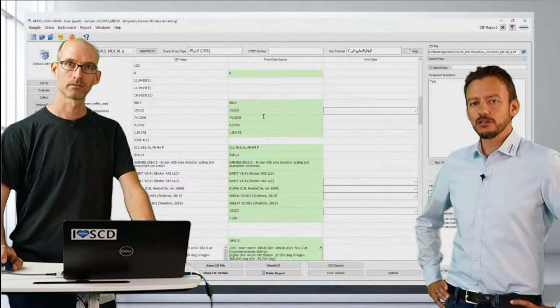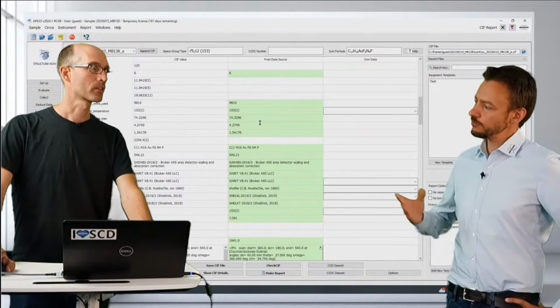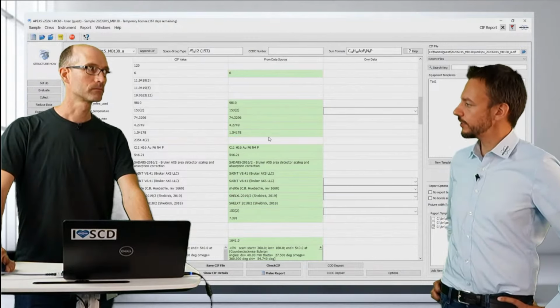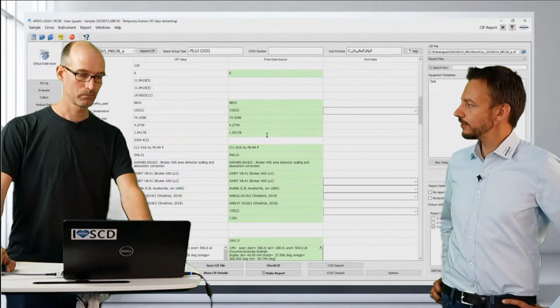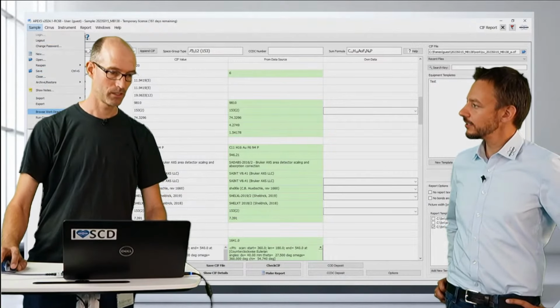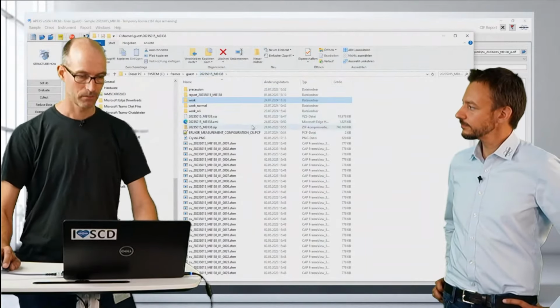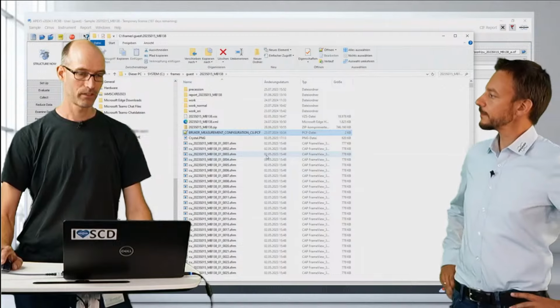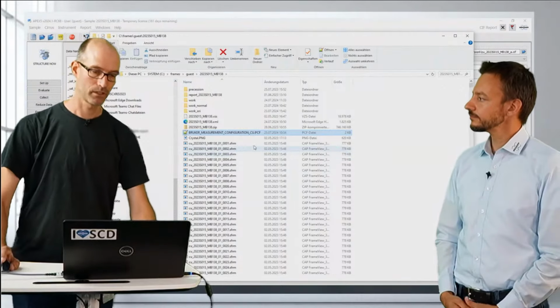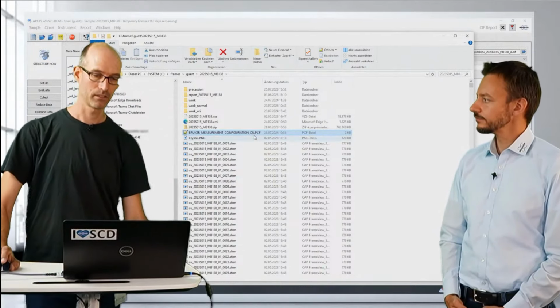Okay. So also quite often a common problem is that people forget to enter the instrument parameters or the instrument components that were used for measuring it. Is that also in now automatically? Yes, that's automatically in there. If you open the sample directory, you will see that there will be a file that is called Bruker measurement configuration underscore the name of the target, in this case copper.